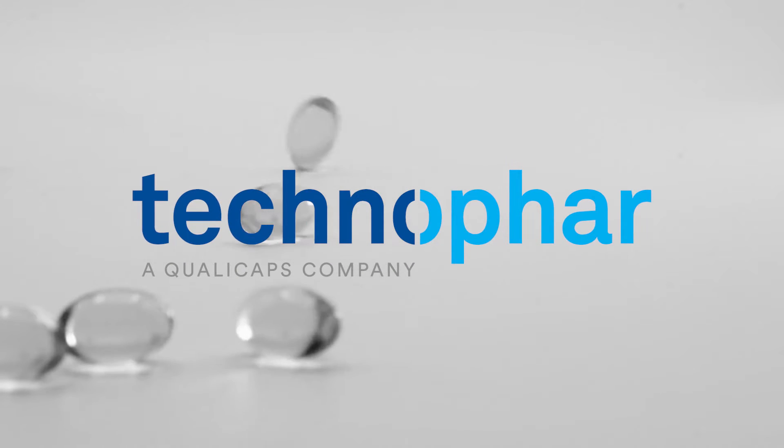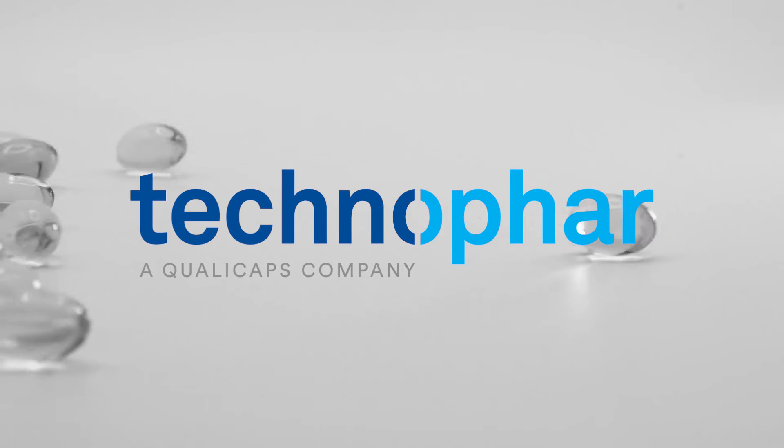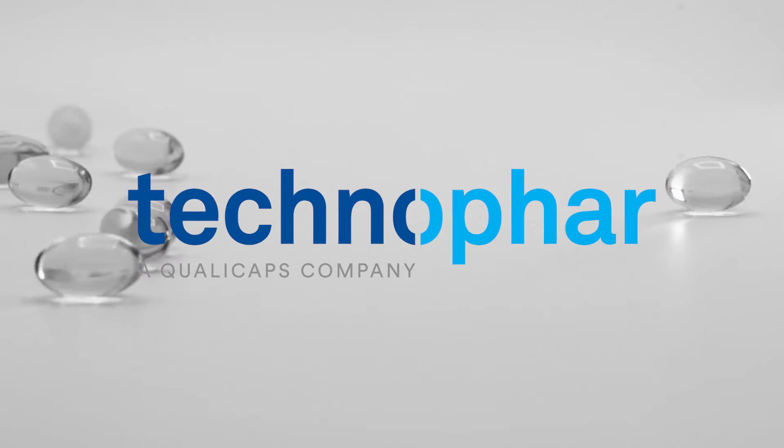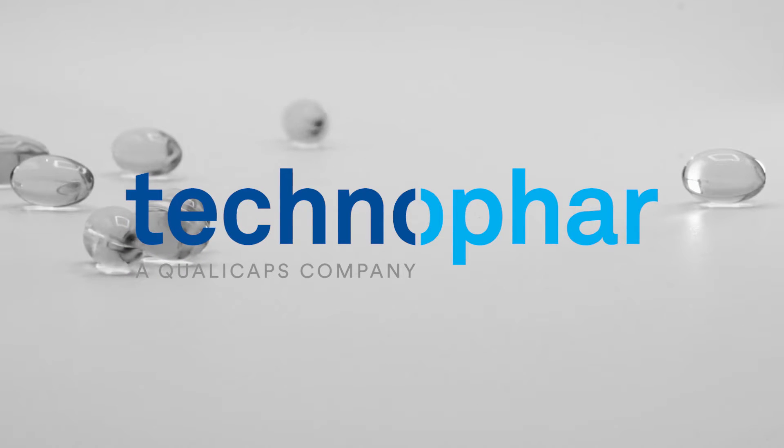TechnoFAR Equipment and Service is a global supplier of soft gelatin encapsulation machines, auxiliary equipment, and turnkey solutions.